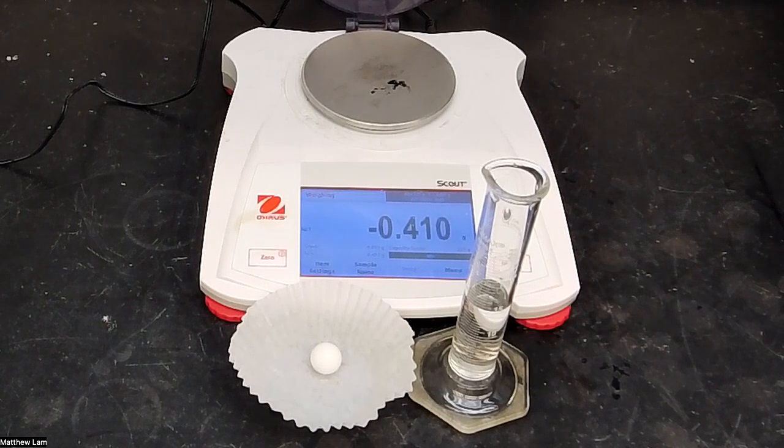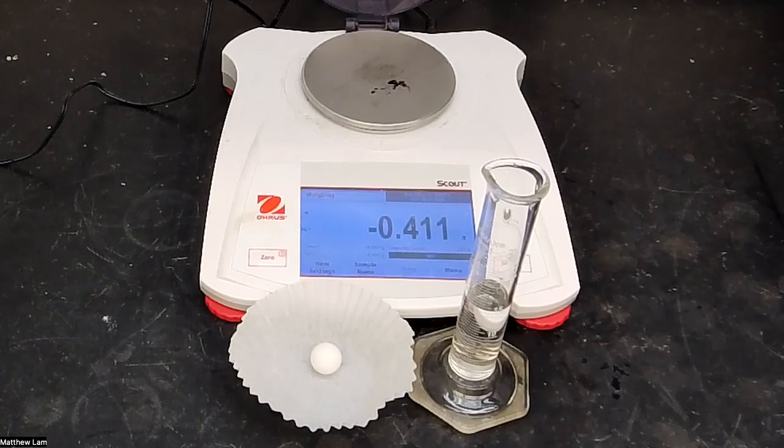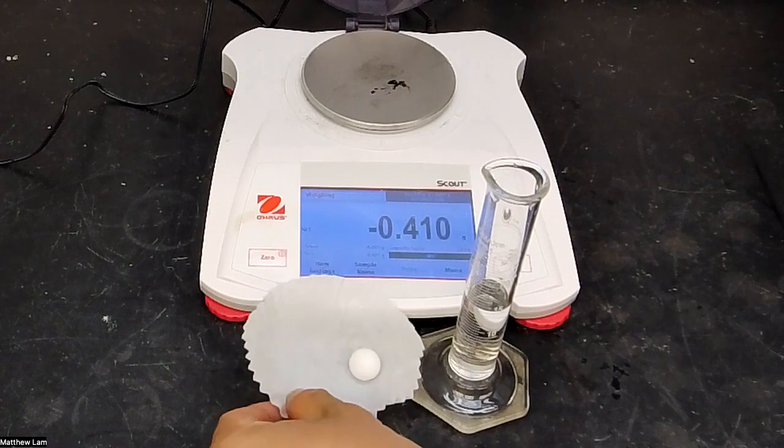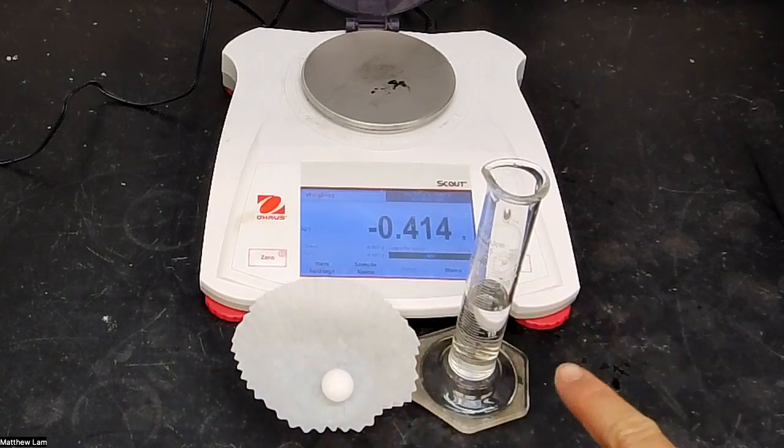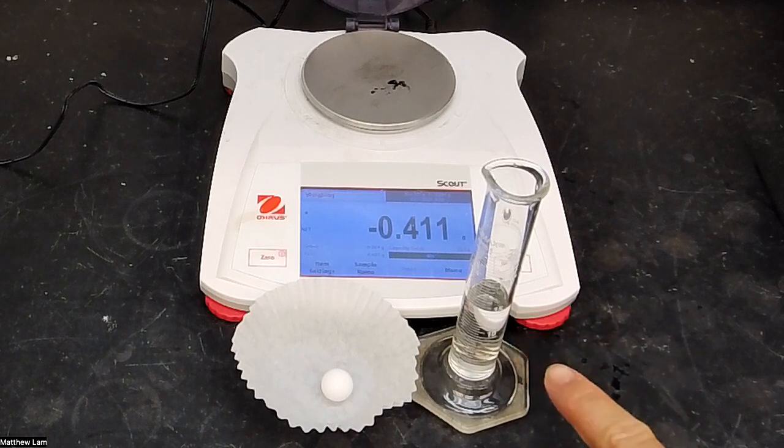Now, density's SI units typically is in kilograms per meters cubed. For this experiment, we are going to determine it in grams per milliliters. So let's quickly go over the materials for this experiment. We have a weigh boat, a Teflon ball, a graduated cylinder, a 25 mil graduated cylinder pre-filled with water, and a balance.